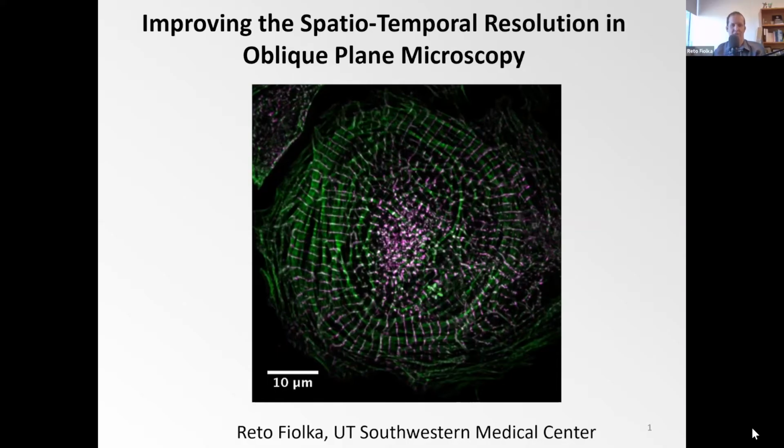Thank you, Brian. Mark. The honor is mine to present to you both Janelia and EMBL, both institutions I value highly. And yes, my talk today is about improving the spatial-temporal resolution. I could have said light sheet microscopy, but as you see in the title, it's oblique plane microscopy, which is a subfield of light sheet that just caught our attention in the last few years. And as such, with such instruments, you can, for example, in a light sheet format, acquire images of cells with finer detail than what you usually can do in a light sheet, like here, this cardiomyocyte.